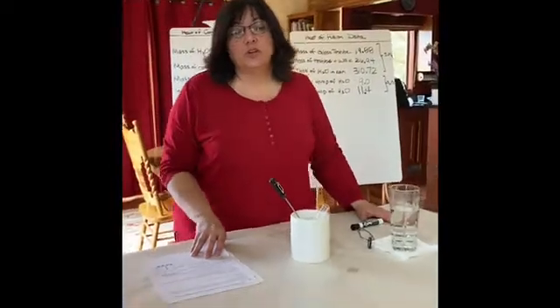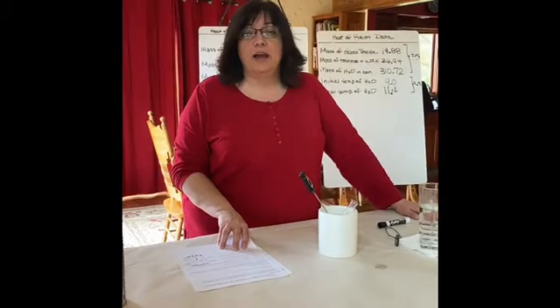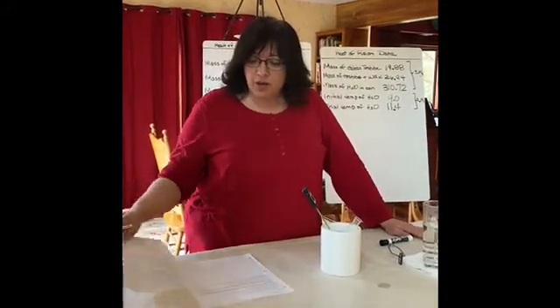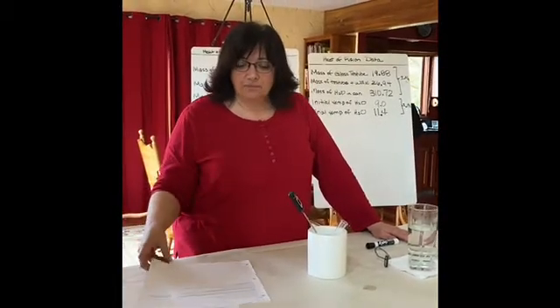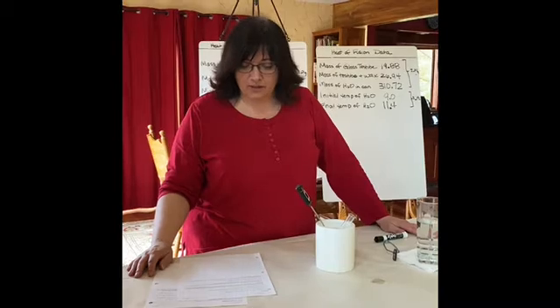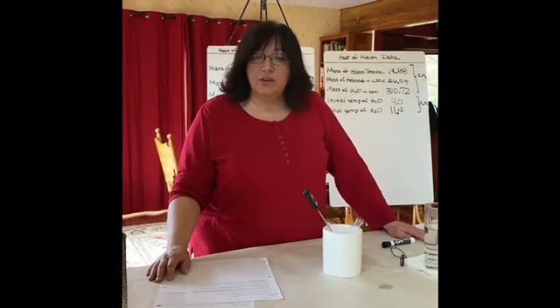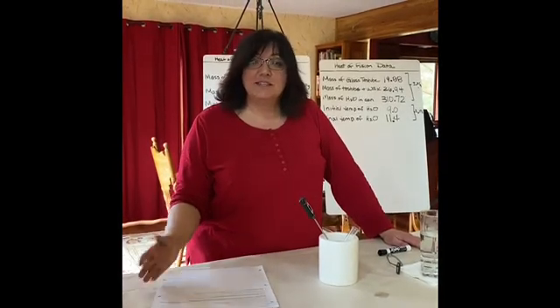This is a really good lab to review a lot of the ideas. You're going to use bond energy to figure out the theoretical heat of combustion. So you've got to write a balanced equation and use the bond energy table for all that. You're going to talk about what kinds of bonds were involved in these two processes and just use a lot of the knowledge from the unit to address the analysis questions. So follow through on everything. Think about what I did and what I could have done wrong, where numbers might not be quite right as far as sources of error goes, and let's see what you come up with.